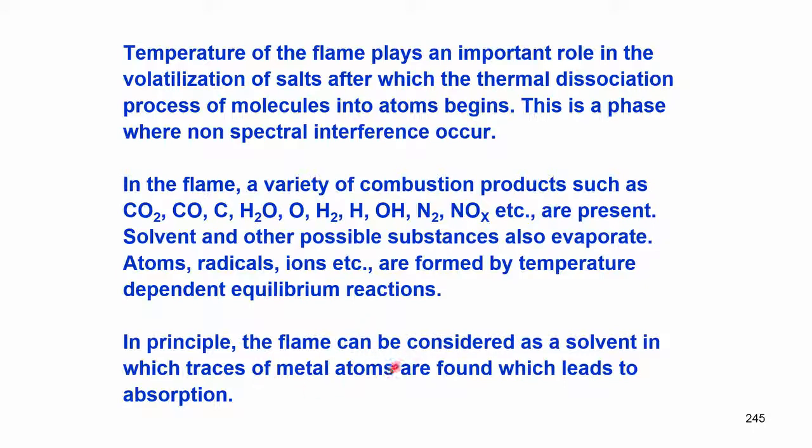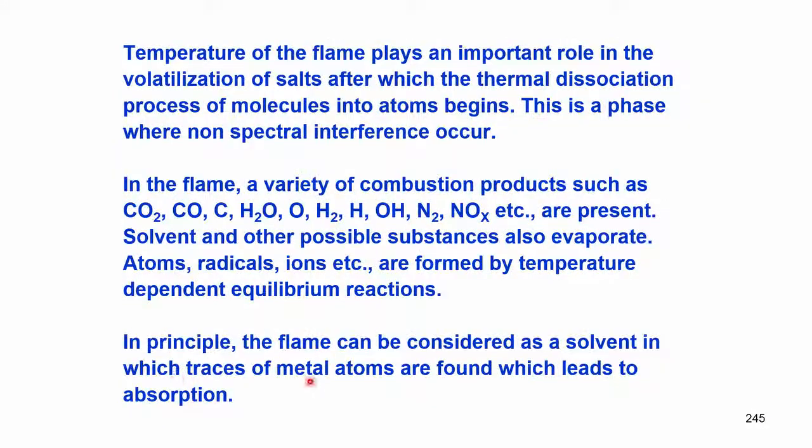So, in principle the flame itself can be considered as a solvent. This is very interesting because the flame on its own does not give rise to any spectral features. So, it can be considered as a solvent. But there could be traces of metals in the solvent also. That means, therefore, what we should do is, if we are extracting the sample in a solvent, we should aspirate the solvent also to obtain the blank reading or reference reading.